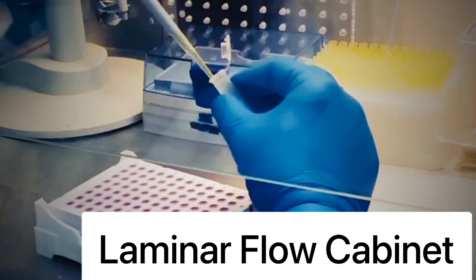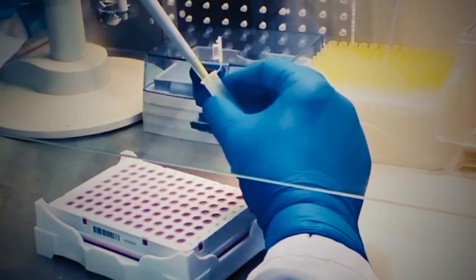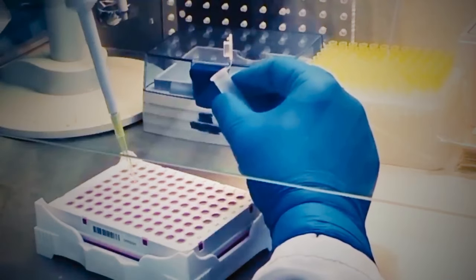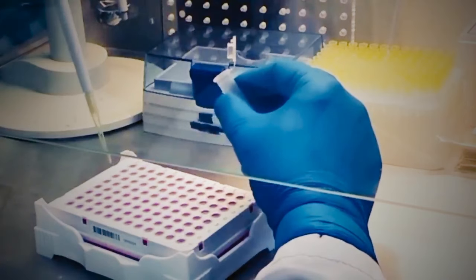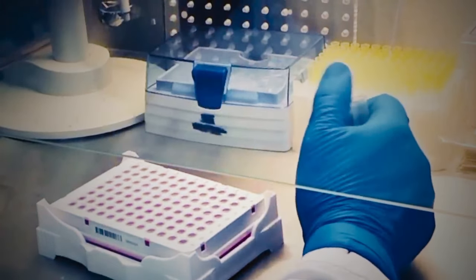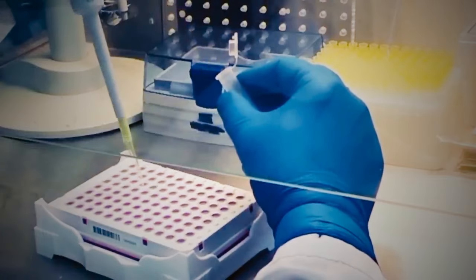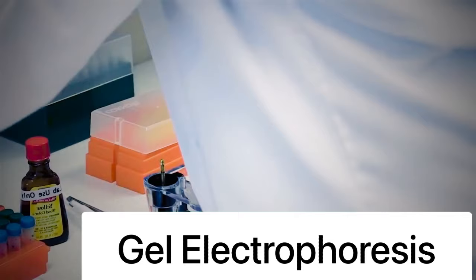Laminar flow cabinet. A laminar flow cabinet or tissue culture hood is a carefully enclosed bench designed to prevent contamination of semiconductor wafers, biological samples, or any particle-sensitive materials. Air is drawn through a HEPA filter and blown in a very smooth, laminar flow towards the user.